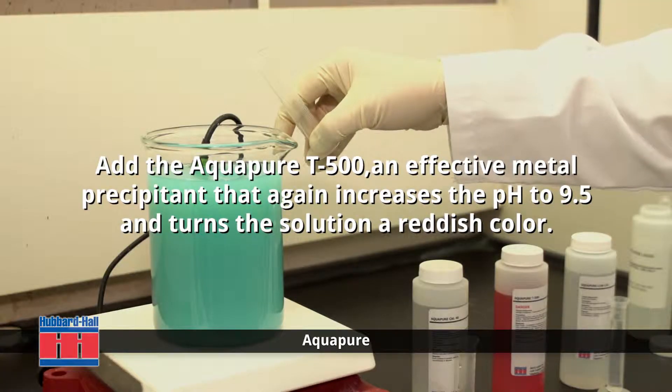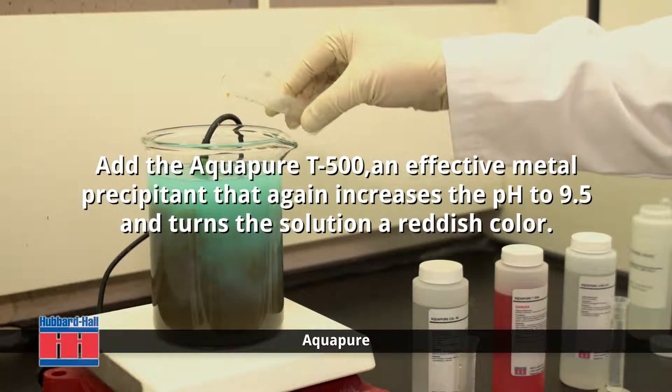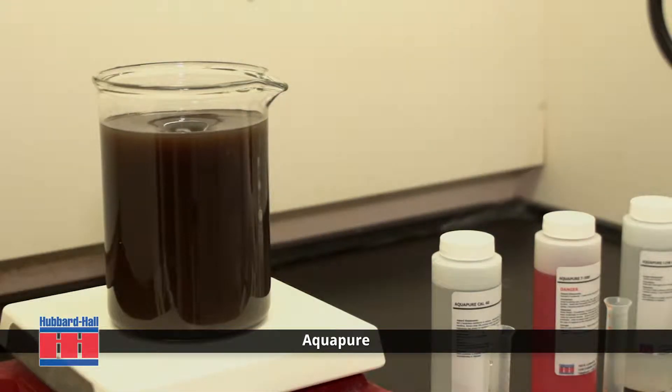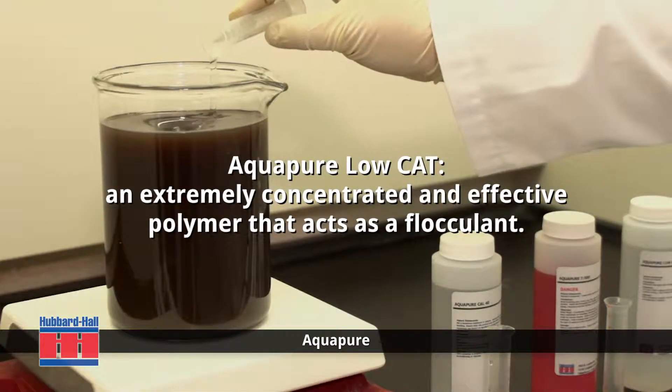Next, we add the AquaPure T500, an effective metal precipitant that increases the pH to 9.5 and turns the solution a reddish color. While the solution continues to mix, the final addition is the AquaPure Low Cat, an extremely concentrated and effective polymer.